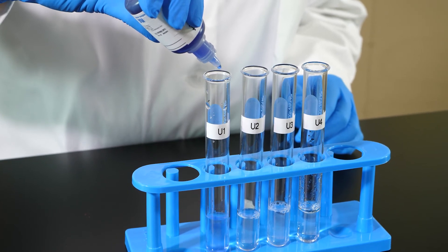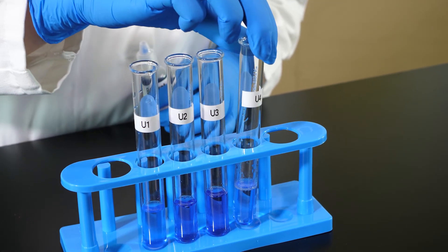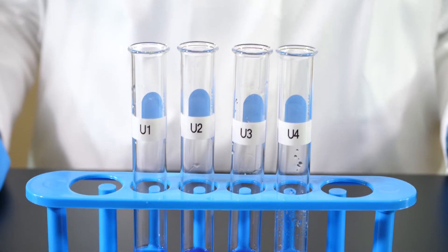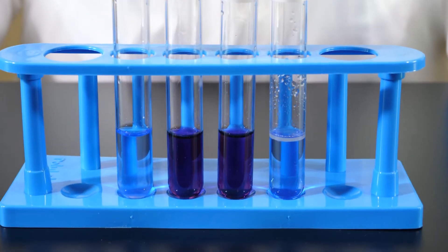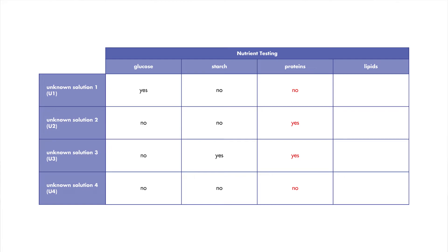We add 20 drops of Biuret reagent to a sample of each of the unknown solutions. After adding the indicator, we swirl each of the test tubes to mix the contents. Since unknown solution 2 and unknown solution 3 both turned dark purple, we know that proteins are present in both solutions. Since neither of the other two unknown solutions turned dark purple, we know that proteins are not present in those solutions. Record your observations in your lab journal.